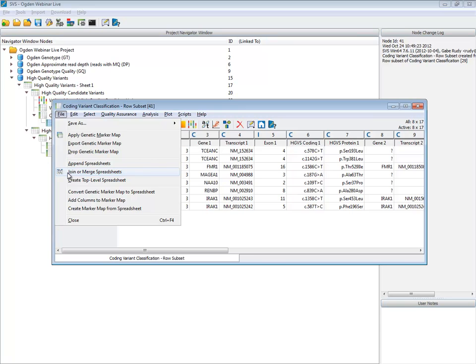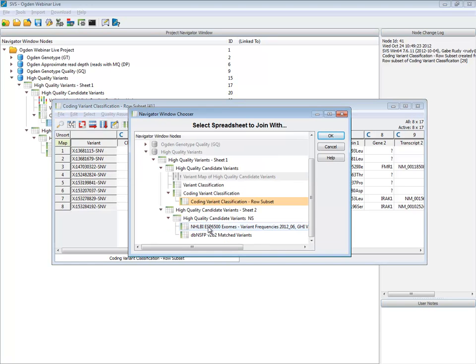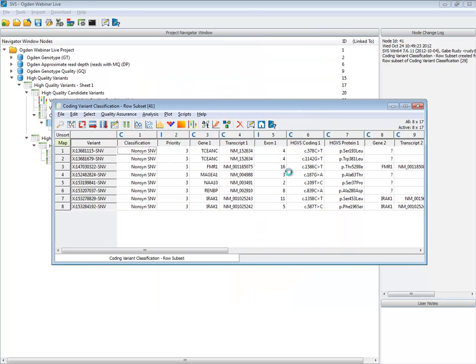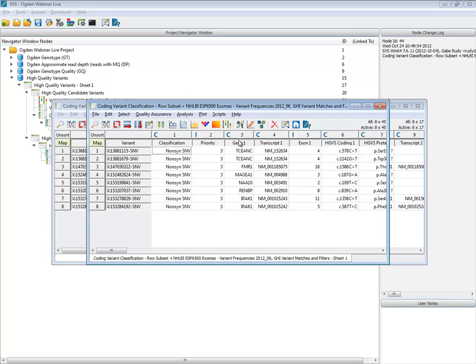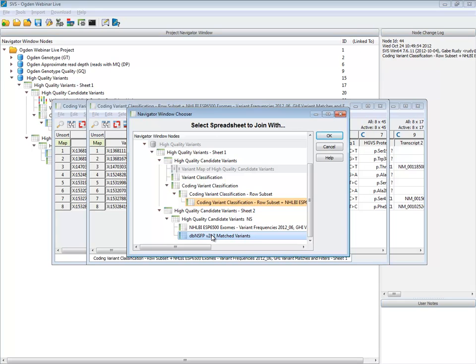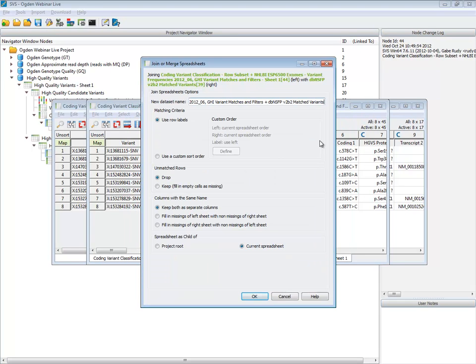I'm going to go to File, Join, and essentially join in these 2 annotations. I can join in the NHLBI 6500. Remember, this one didn't actually have all 8, so I have to say if there's unmatched rows, go ahead and keep those. So I keep my full set of 8 variants. So now I still have 8. And while we're at it, let's join in the non-synonymous functional prediction. Go ahead and say keep.